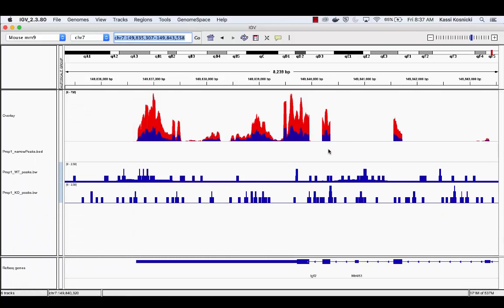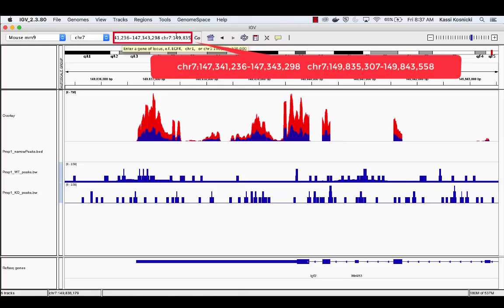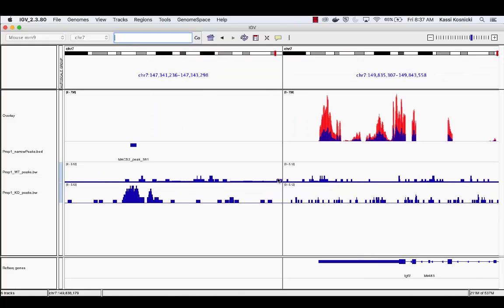Input the recorded locus region from the binding site before the current locus region in the text box. Then, hit the space bar and select Go. This will create a split screen, allowing us to see the binding site and gene expression in one frame. With the wild-type in red and the knockout in blue, we can see that the binding of the Prep1 transcription factor results in an upregulation of this gene's expression.